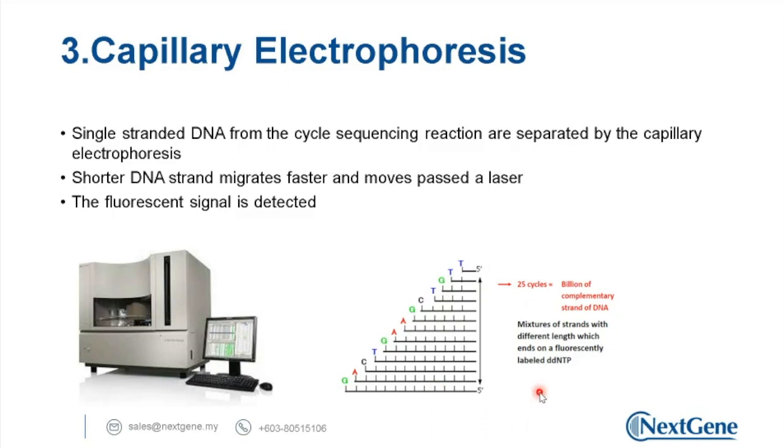And the second thing is possibly not common, but when we do sequencing, the primer is actually not the same one. Let's say the user sent us the sample. They told us that they are using the universal 16S primer. Sometimes for those universal primers, the sequencing house will use their in-house primers, which means the user does not need to send their own primers. So in one case, the customer said, oh, I'm using this particular primer, so please use this for sequencing.